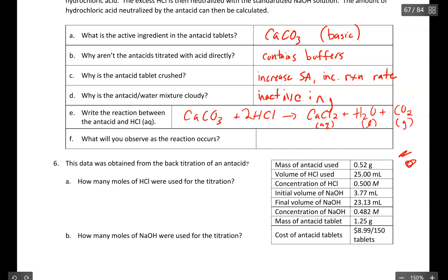And what are we going to observe as this reaction occurs? You should see bubbles. And that's just the carbon dioxide escaping. And that's going to be our indicator that no more gas is being produced. The reaction is finished. Now I'm ready to titrate.